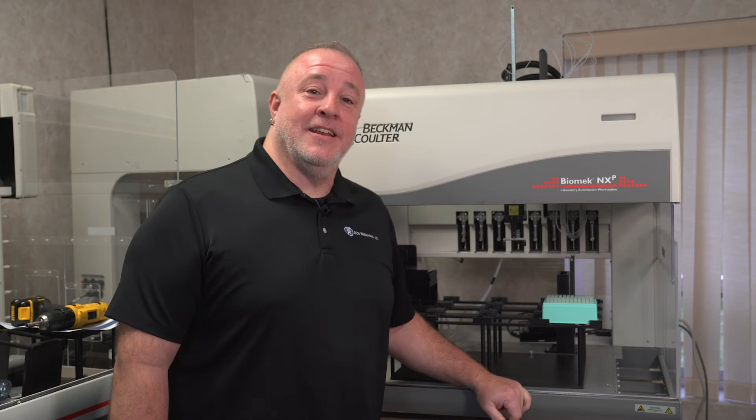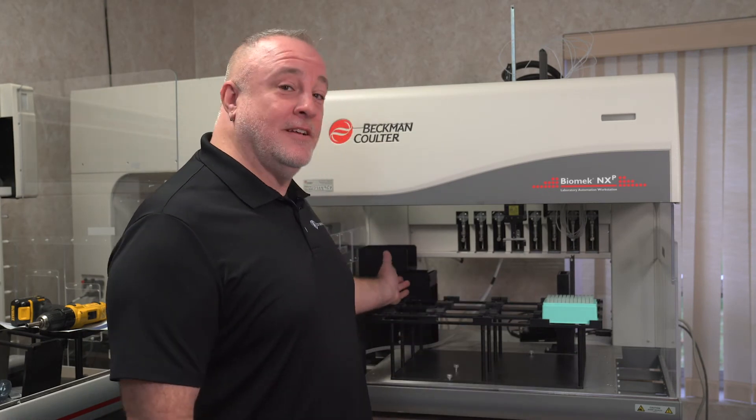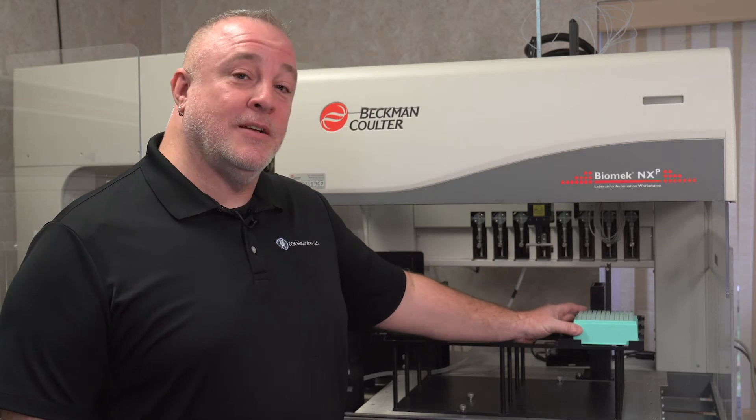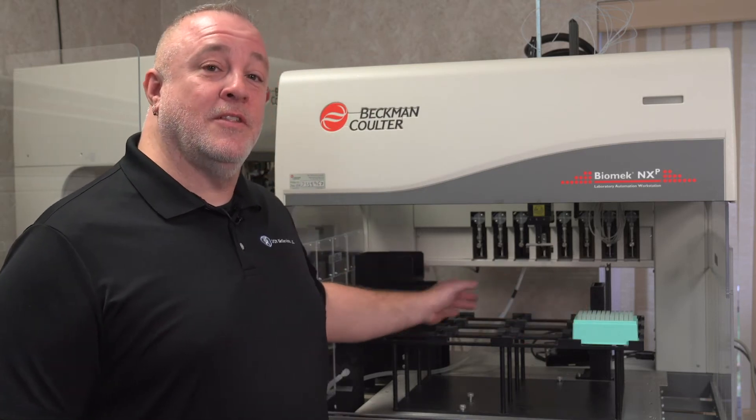Normally with the Biomex Span 8, it throws its tips into the trash when it's done. With the addition of this piece here, it'll be able to shuck the tips into the tip box instead of throwing them into the trash, so they can be reused.